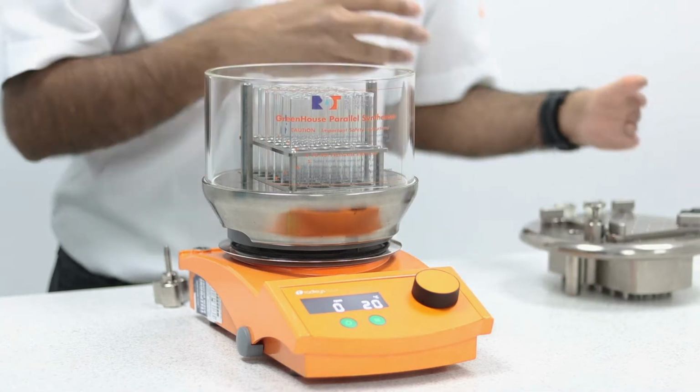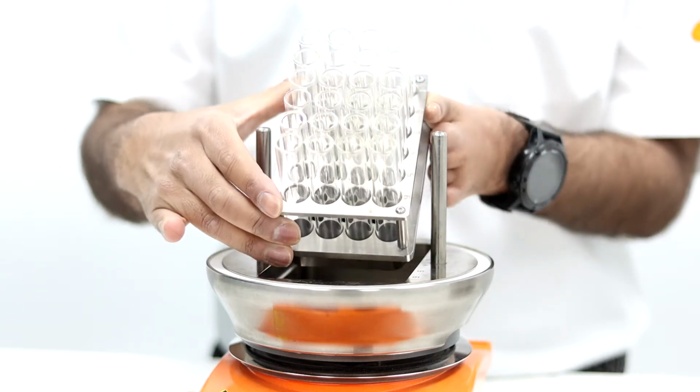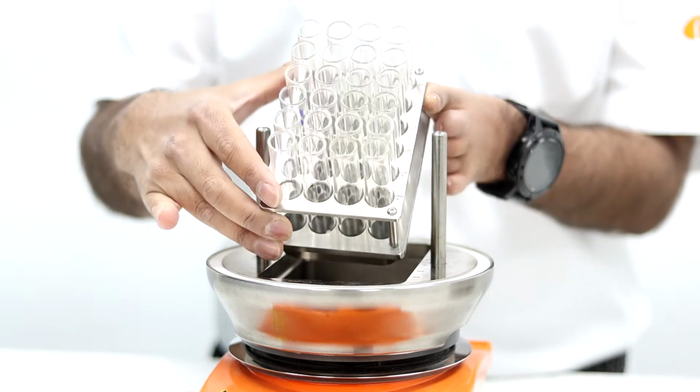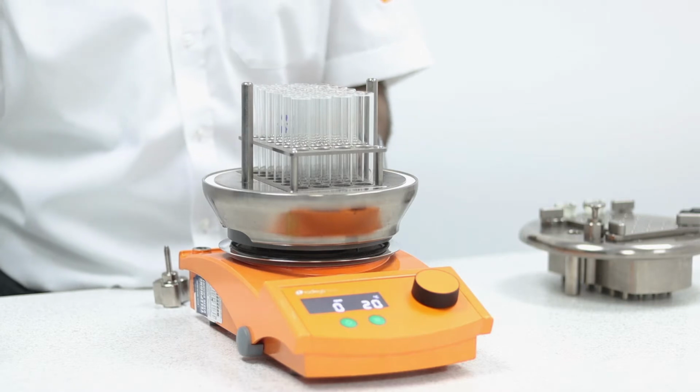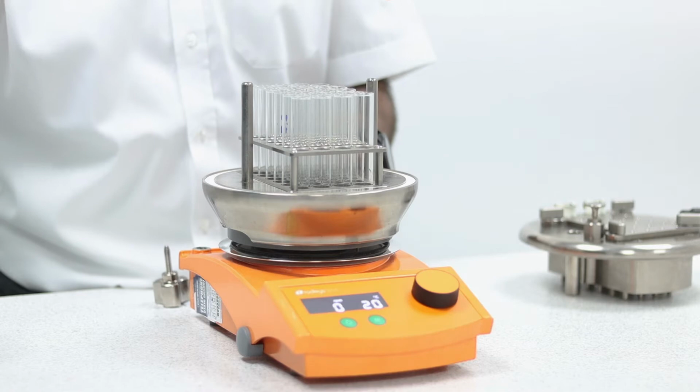In the reaction block, you can hold up to 24 glass reaction tubes. The block itself is the same footprint as a standard microtiter plate, and this allows the rapid transfer of material from your standard microtiter plate using a multi-channel pipette into your reaction block.